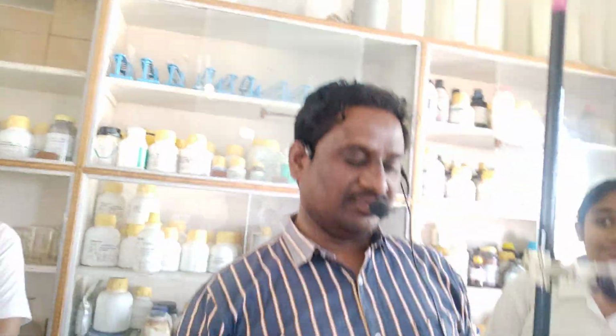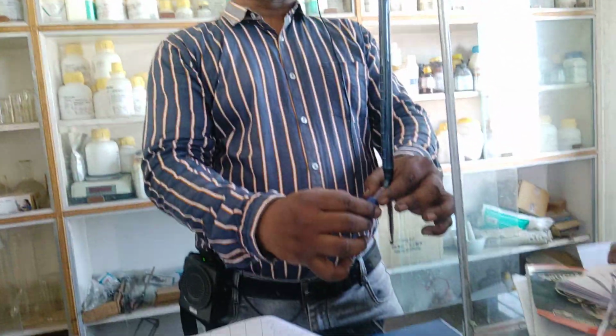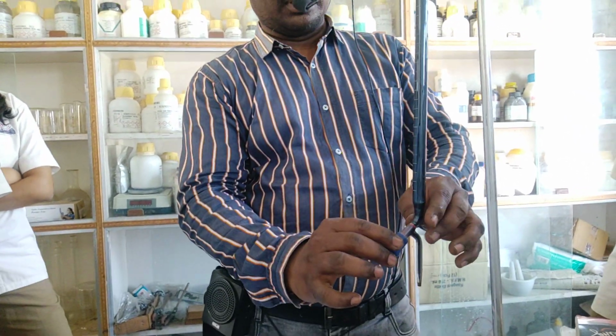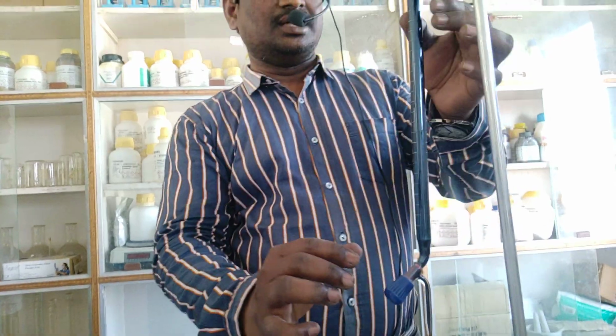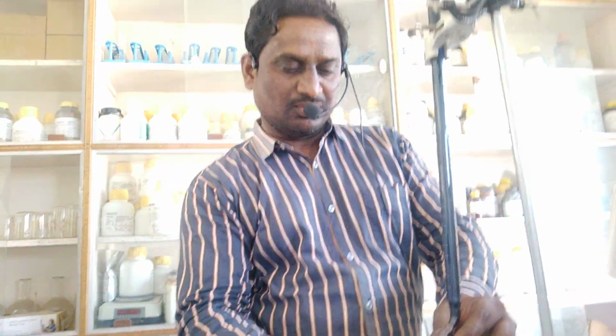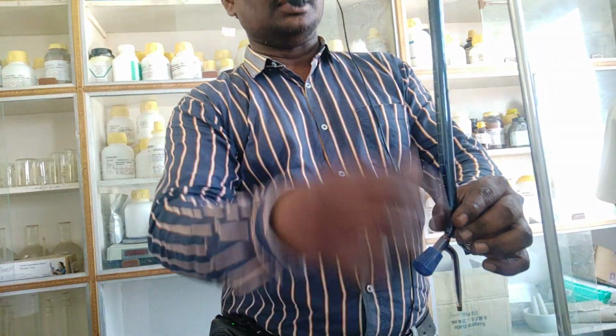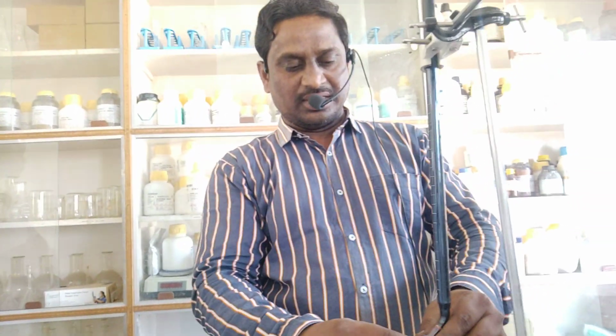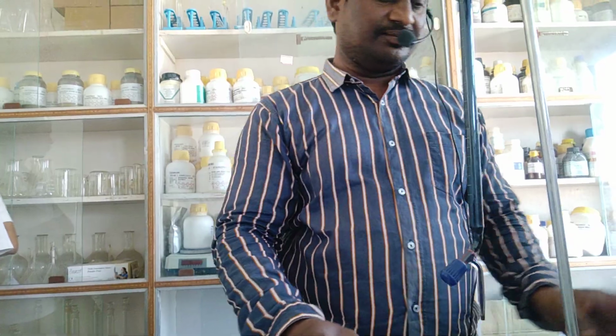Listen carefully. This is what we call the stopcock. What is the use of this stopcock? To release the potassium permanganate, and immediately if you want you can stop also. This one you have to move slowly. If you move this fast, this KMnO4 will fall down very fast. So that's why, while releasing this potassium permanganate, you have to release it slowly. Clear?